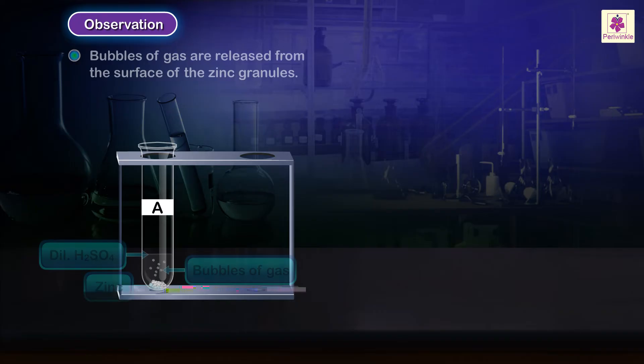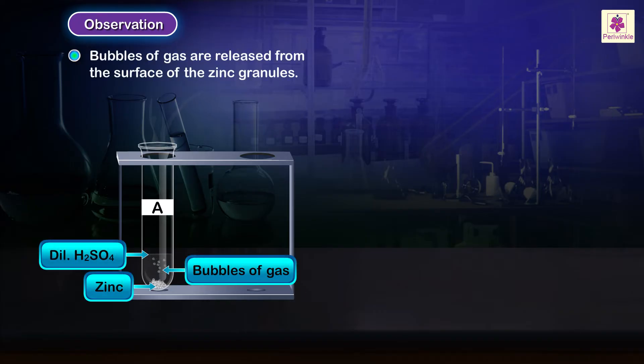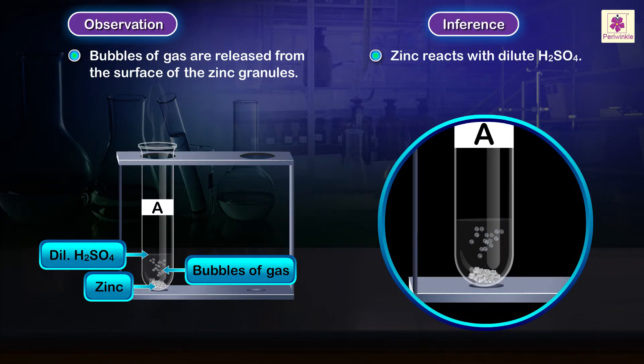Observation: Bubbles of gas are released from the surface of the zinc granules. Inference: Zinc reacts with dilute sulfuric acid.